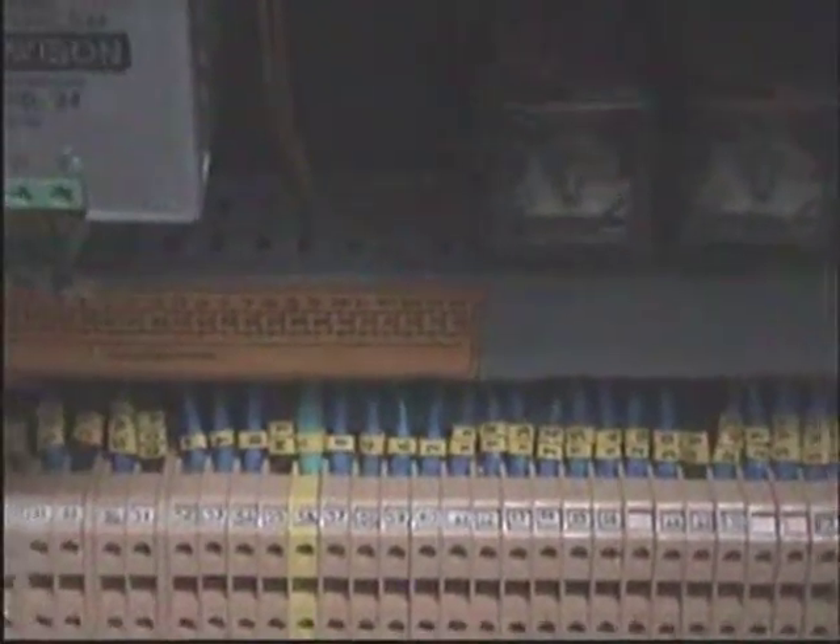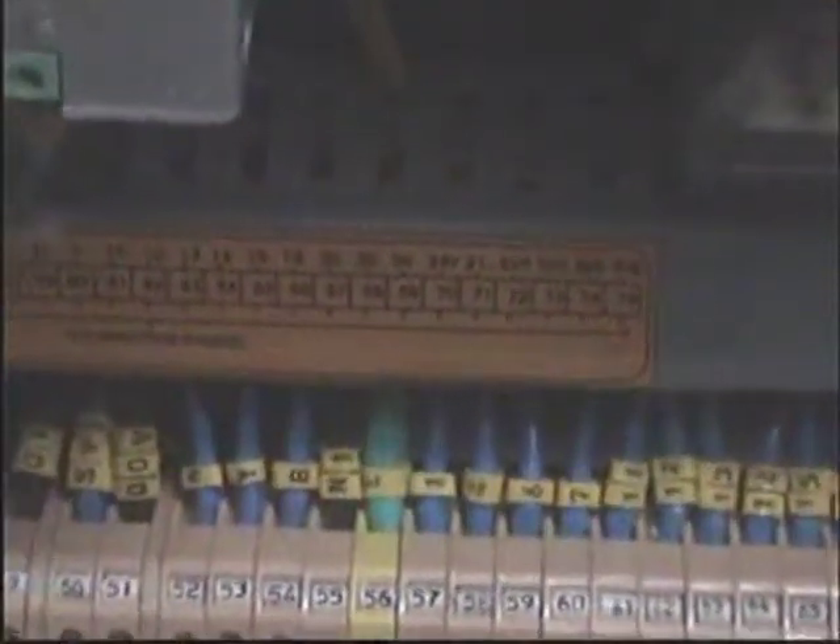This is the box where you house the two vacuum pumps. This is the control panel which is housed on the back of the machine. All the wires you are seeing are properly numbered and everything is serially labeled, so that any electrician can do the maintenance at your site.